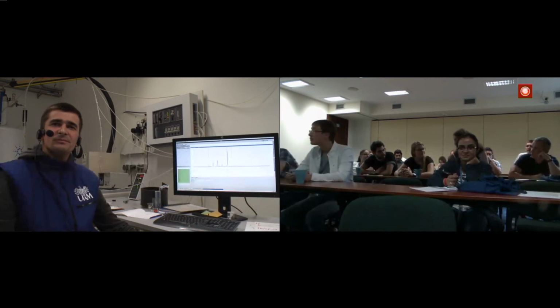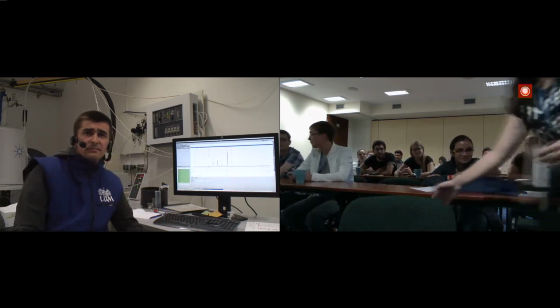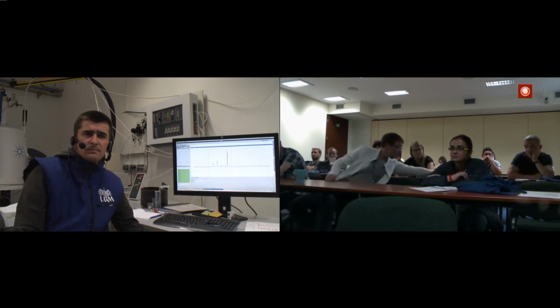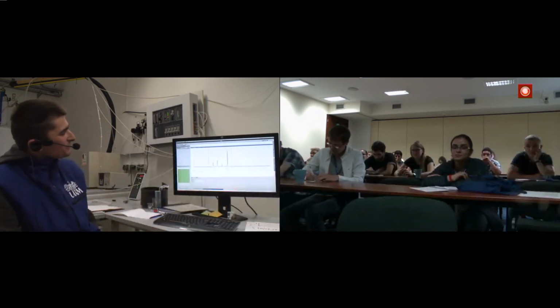Can I ask something? If you want to integrate the signal, do you have to account for all of the peaks, sidebands included? Okay. In that case, to be honest, that's a good question. If you would like to integrate, I would say that you would probably have to integrate over the sidebands as well, but I'm not sure about that.